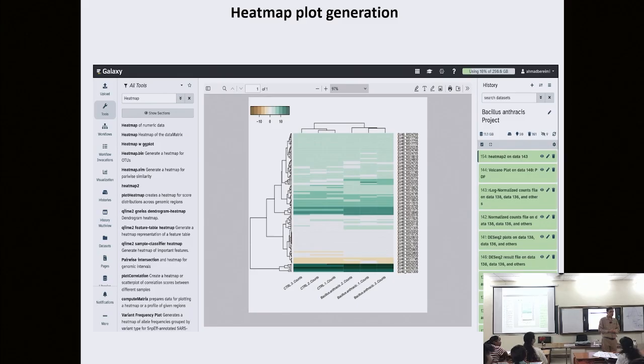You can narrow down, and the way people narrow down, I think that's a very naive way of doing it: I am going to take the top 10 up-regulated genes and the top 10 down-regulated genes. That's not the right way, okay? Because it is likely that the major phenotype being observed is not arising from them. It could be arising from some moderately expressed genes. So that is why it is important that you go beyond single gene analysis and start doing pathway or functional analysis.